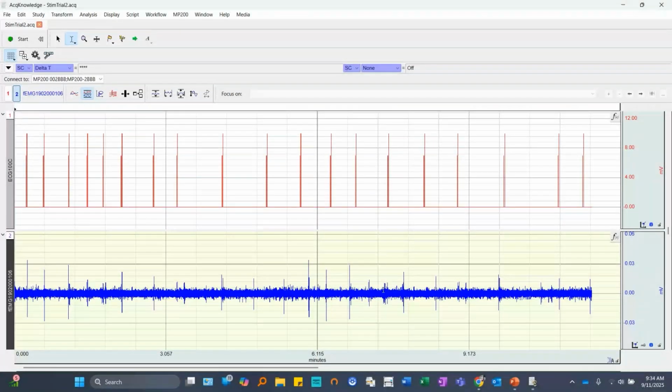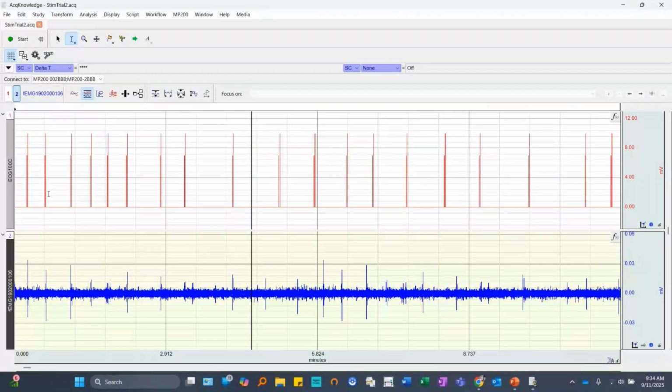And so the question is, of course, if you have run 50 or 100 subjects through, and especially if you brought them back multiple times, so you might have 5 trials on each subject, as you know, the largest part of your time burden generally becomes the analysis. And having somebody step through each of these files by hand, one by one, obviously can be extremely time consuming. So there's a huge benefit to creating a workflow for this, which can help with that and help automate it.